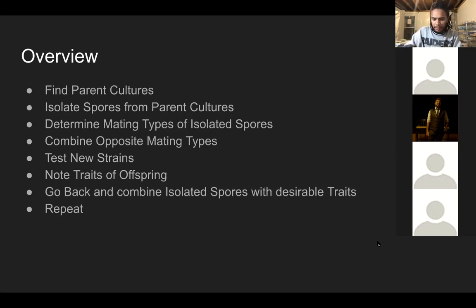Just like I mentioned earlier, you're going to want to be careful that none of them pop open. One of them popped open because it got too hot, building up steam. So I need to close that really quick. My apologies. This is what happens when you're doing DIY science and you gotta make do with what you got. It also helps when they're straight up and down. If they fall down and they're on their side when they're in your little jar for heating them up, they're gonna pop open a little bit easier.